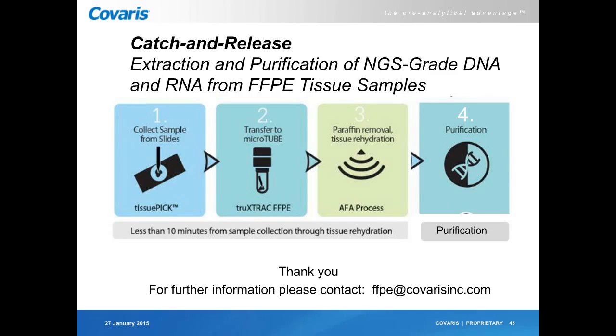And so when we go to the tissue digestion by protease, we have this very well rehydrated tissue matrix that will be a very good substrate for the protease. So we have a very efficient protease digestion. And then, as we didn't really damage the cross-link, we have a very efficient cross-link reversal. So we don't have any single peptide still on the DNA. So it means that we are getting a very good template for polymerase, for library construction or PCR.